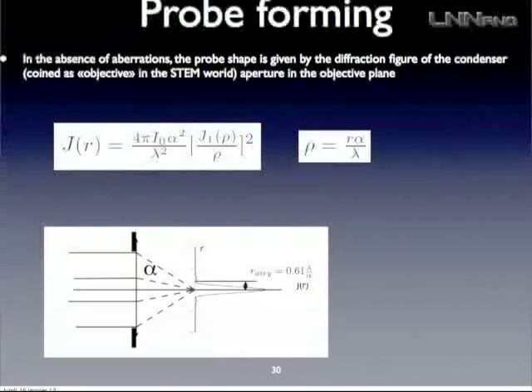And that's the reason why it's sometimes much easier to understand aberration correction in an STEM than in a TEM, because it's really directly obvious that if a way to make a small probe is to increase angle, then you have to correct for any aberrations that will come with a high angle. So if you want a small probe, you need either or both of them, either a low wavelength or a high angle. So this is for a perfect world.